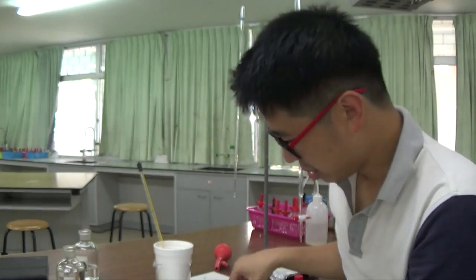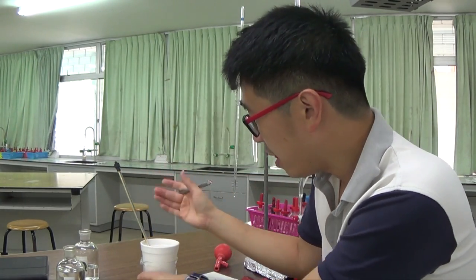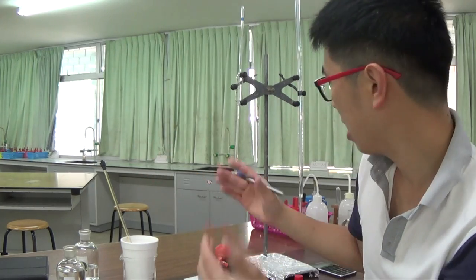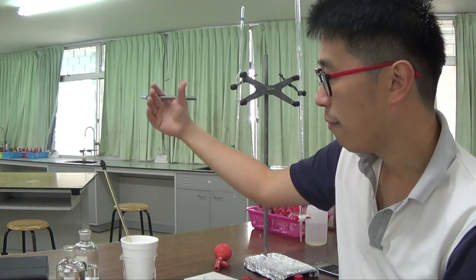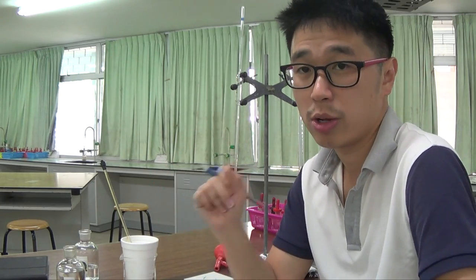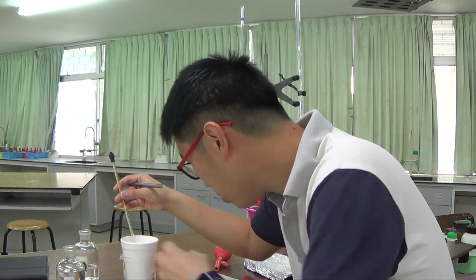Alright, so this was 25.0 cm cubed of P. For the initial temperature, I let the thermometer sit in there for maybe a minute before I read the temperature, because the thermometer was just taken out from the air outside, and it needs some time to equilibrate, to come to the actual temperature of the solution. So I don't record the temperature of the solution straight away, okay? Give it at least 30 seconds or 1 minute, which it has already been. So I'm going to read the temperature of the solution now.